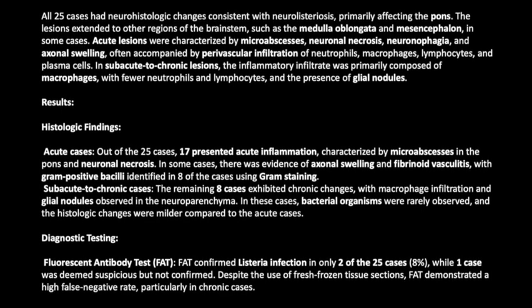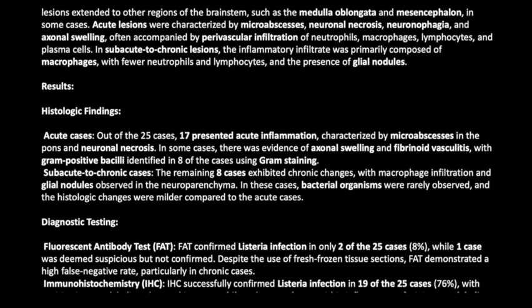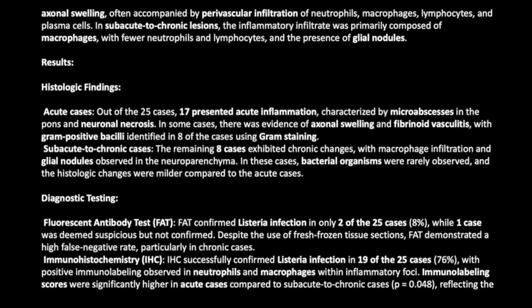Subacute to chronic cases. The remaining 8 cases exhibited chronic changes, with macrophage infiltration and glial nodules observed in the neuroparenchyma. In these cases, bacterial organisms were rarely observed, and the histologic changes were milder compared to the acute cases.